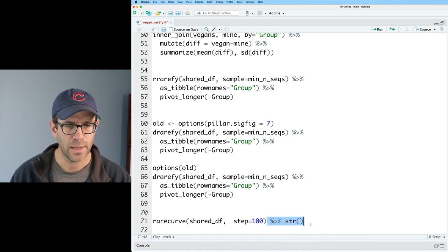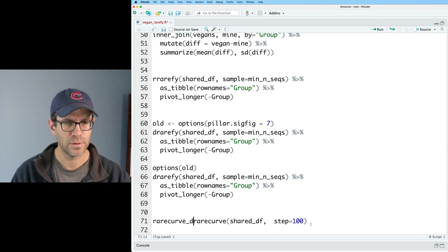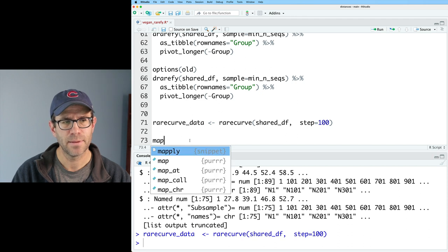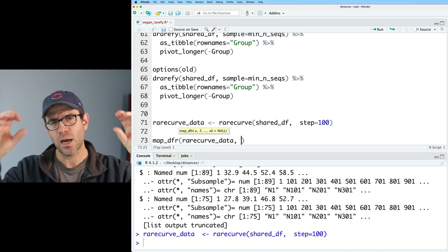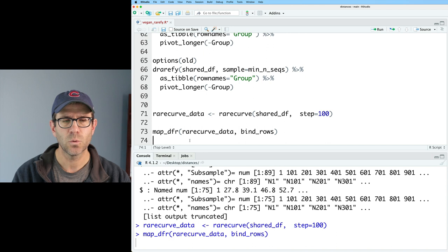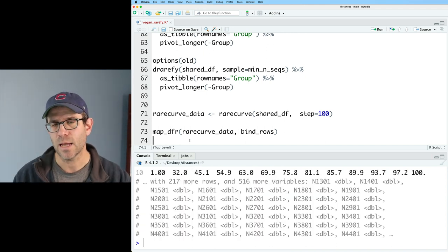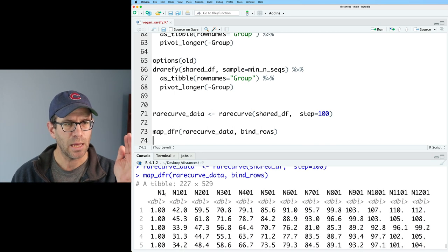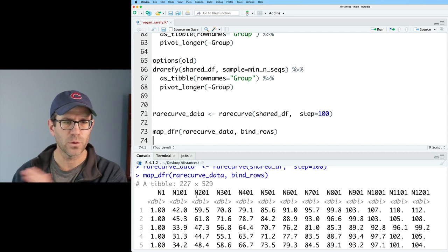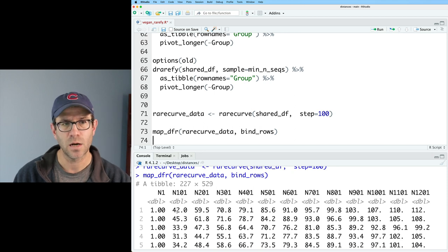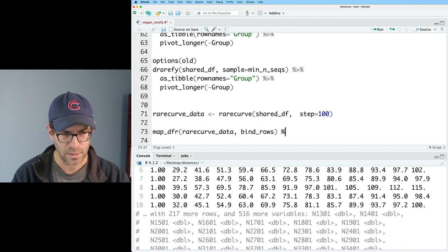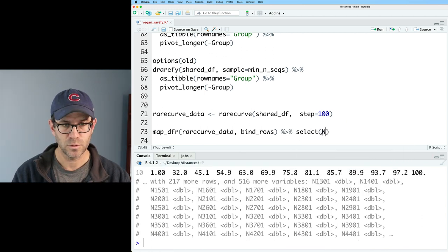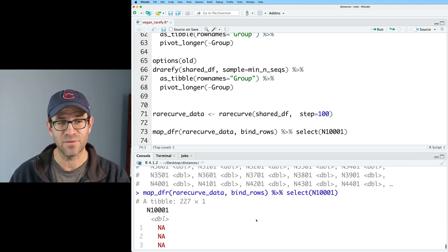And so then what we want is we want to get this out of this kind of funky list and into a tibble so we can then go into ggplot. So I'm going to go ahead and save this as my_rarecurve_data. I'm going to take rarecurve_data, and I'm going to use map_dfr on rarecurve_data. And basically what this will do is it'll take each element of the list, which is rarecurve_data, and I'm going to then do bind_rows. And so what bind_rows will do is it'll bind together each of those elements to make a data frame. And what we'll see is that we have n1, 101, and so forth. These are our sampling depths going across the column names, and then our rows are our different samples.